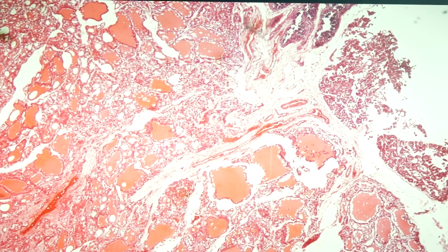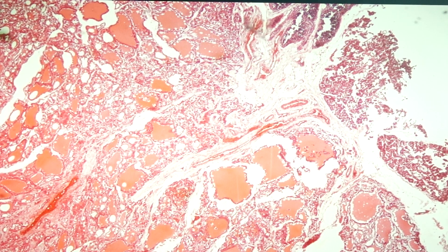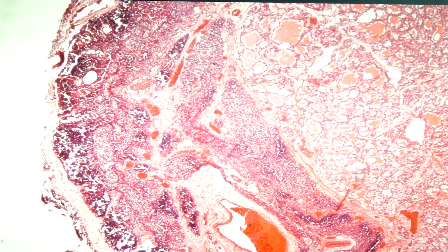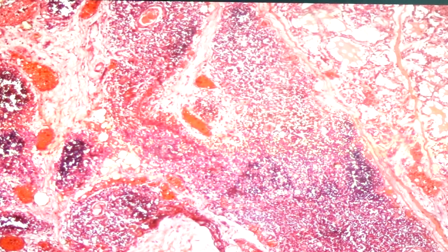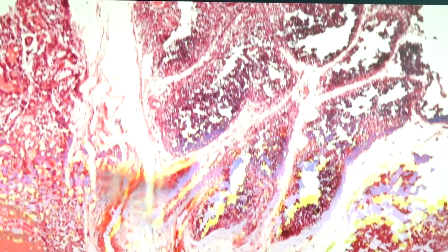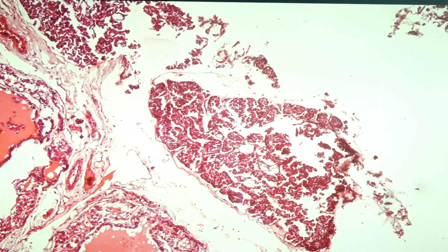Let us start with the parathyroid gland. Looking at the slide, the majority of the areas would be the thyroid gland, and on this side we would see the lymph node. These are the thyroid follicles. This one would be another lymph node. So the parathyroid gland is this one — it is adjacent to the thyroid gland.